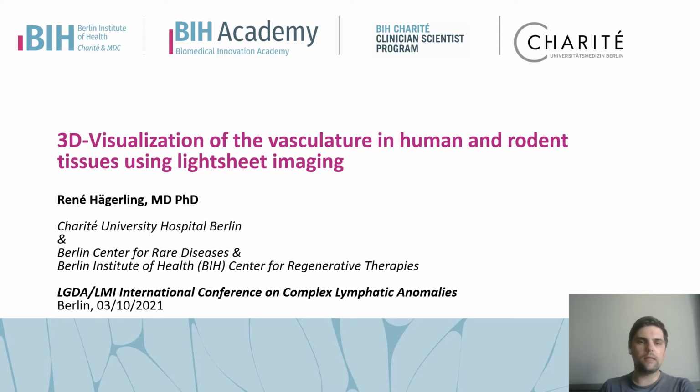Hello, I'm René Hägerling and I will now talk about 3D visualization of the vasculature in human and rodent tissue samples using light sheet imaging.